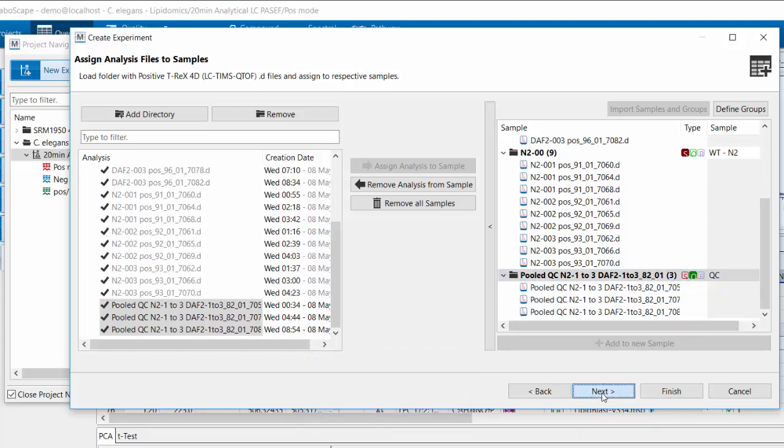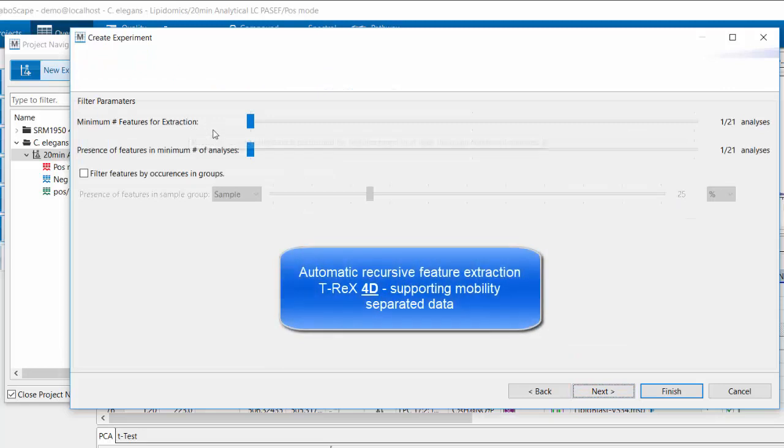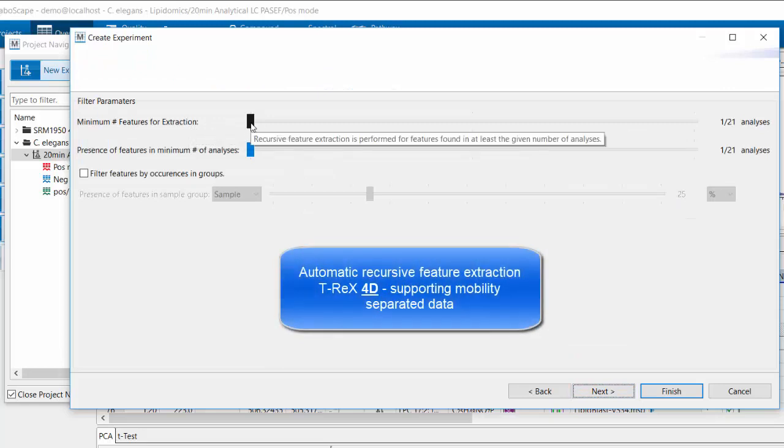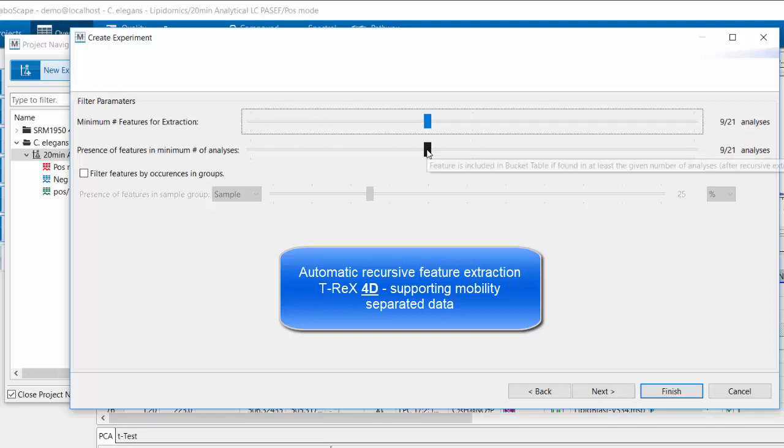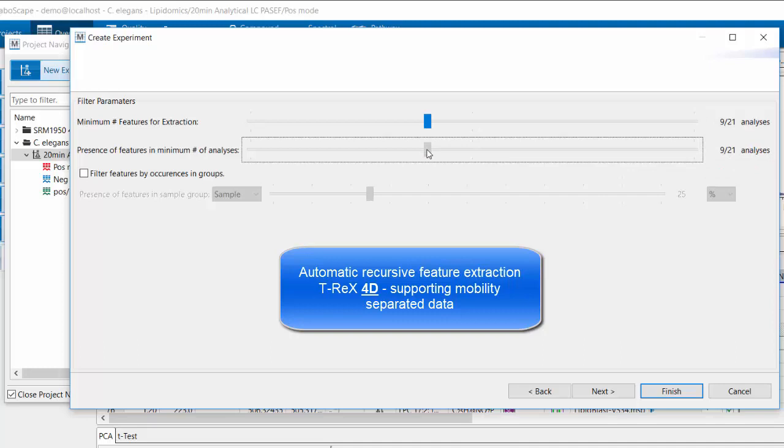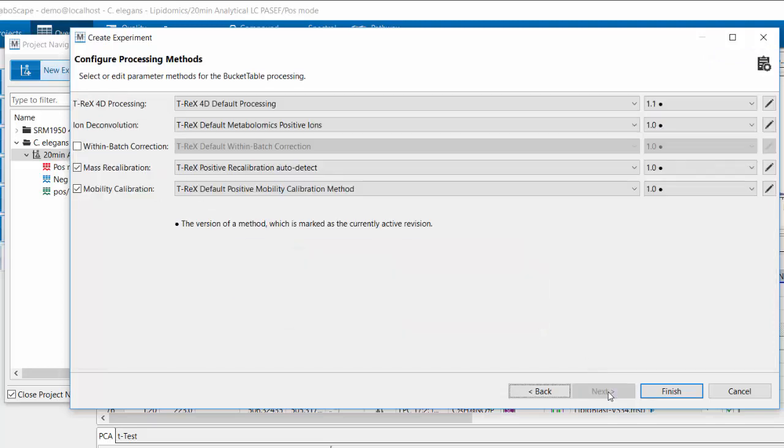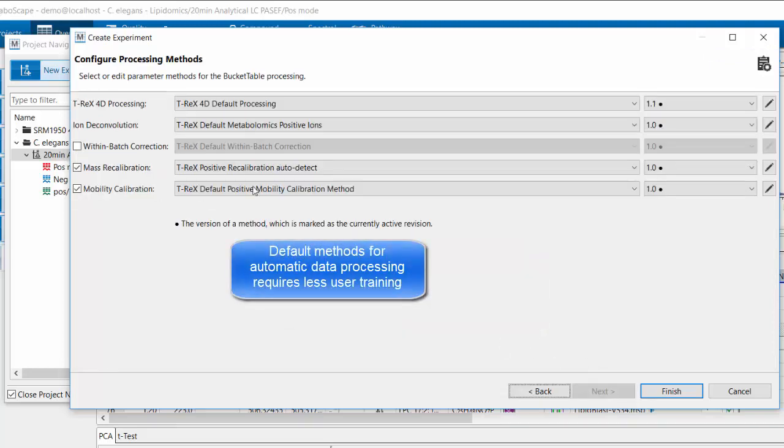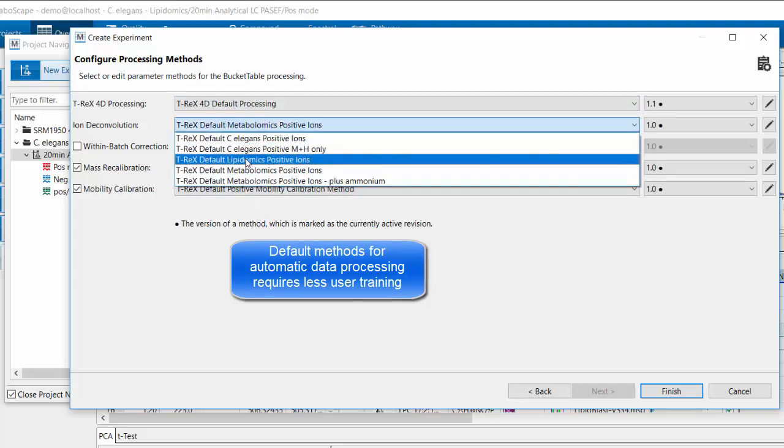The next step in this data import wizard is to define the recursive feature extraction parameters. Here I define that in case a feature is found in 9 out of 21 analyses but not found in others, it should go back and automatically check for the presence of these features in the samples where it was not found, and it will automatically conduct this.